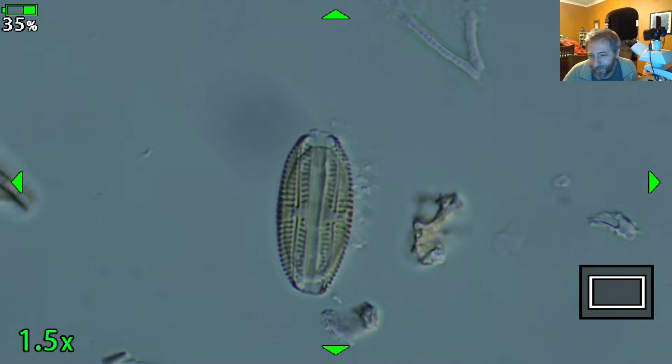Rams Reef asked, Amphora like the jug? It's like a two-mouthed jug. That's where it got its name from. Good observation, the Greek urns or whatever that have two mouths. So Amphora, because both of the raphes are on the same side, which is unusual for diatoms, where you have two valves and the raphes are visible at the same time.